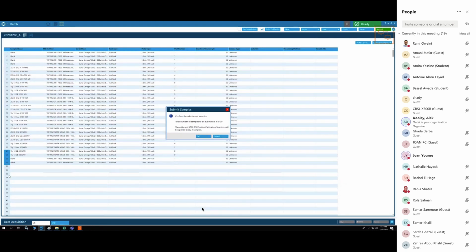Yeah, absolutely. I don't know how you want to organize it. I organize it by days. So I have a batch for each day, and then I have this letter. Sometimes I may then work on B and C and D. It depends on how much work I'm doing. And also you can add to the bottom here and keep going. It's also okay, either way.